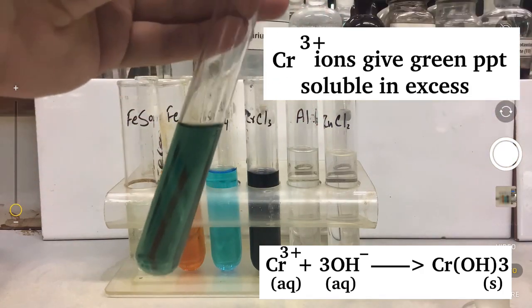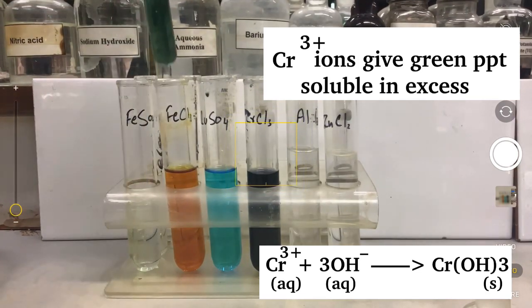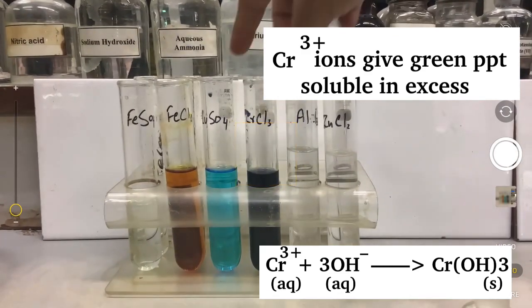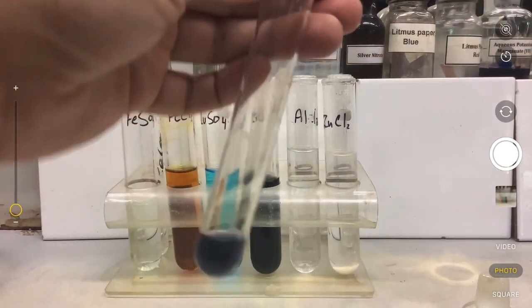But something new happens here, that when you add excess, the precipitates dissolve. The green precipitate of iron 2 never dissolved, but in case of chromium 3, they do dissolve. Now let's perform the similar kind of testing on this sample using aqueous ammonia.